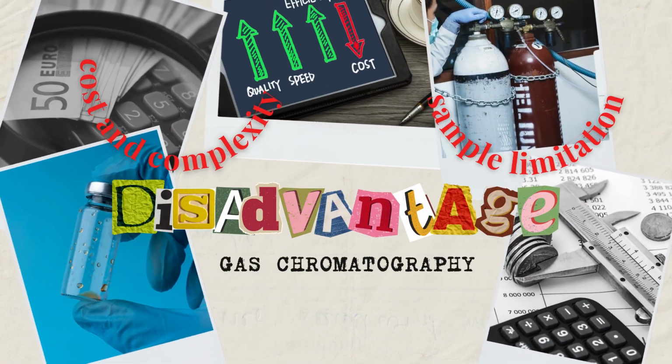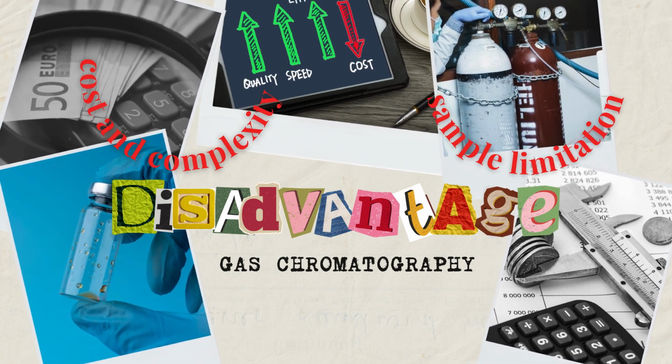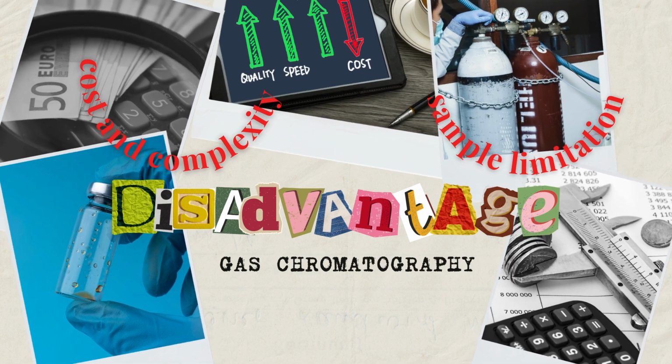The disadvantages of gas chromatography: cost and complexity. The purchase of GC equipment can be costly and requires skilled operators to produce proper results. Next, sample limitation. Non-volatile compounds cannot be analyzed directly without prior derivatization, limiting the scope of GC applicability.